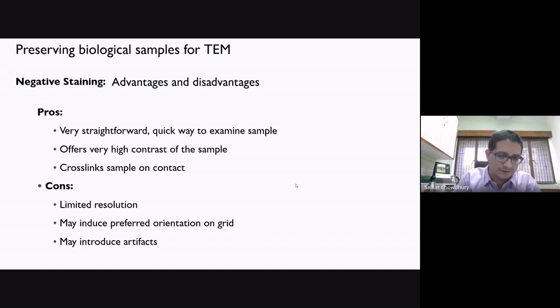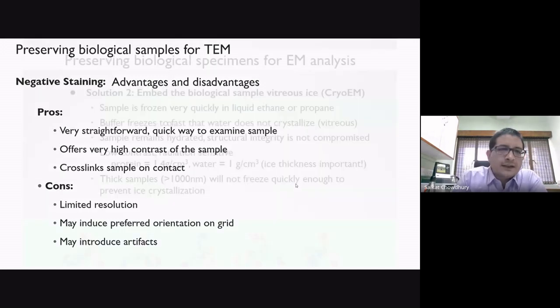And for several labs and places where there is no access to a Cryo-EM or a high-end microscope, this is much cheaper, not very cheap, but at least cheaper in some way. People can quickly have access to such microscopes to check some of the samples. And a lot of the time, these TEM images are enough for a publication and for papers.